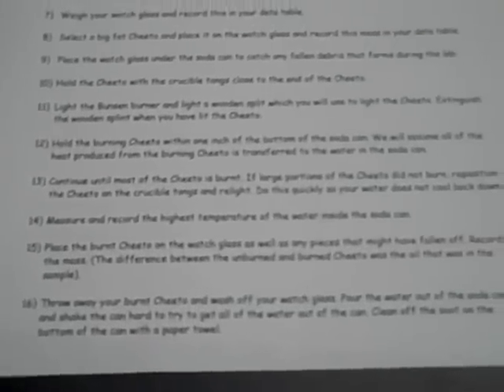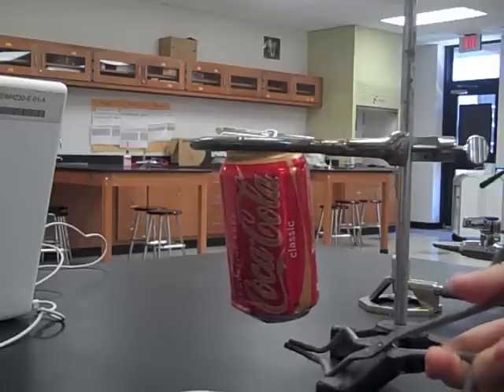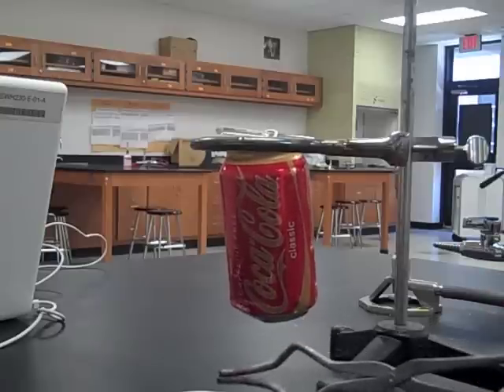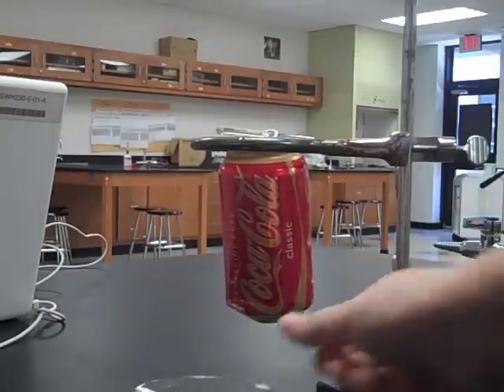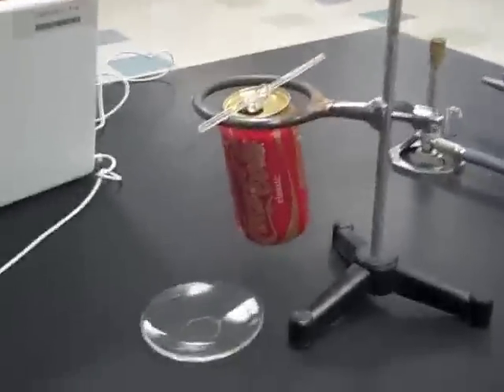Keep the Bunsen burner lit just in case you need to relight the Cheeto. If more than 50 percent of your Cheeto burns, that's fine. When you're heating it, keep the crucible tongs and the Cheeto close to the bottom of the can, but not so close that you extinguish the flame. Keep your watch glass close by in case you need to catch some falling debris.